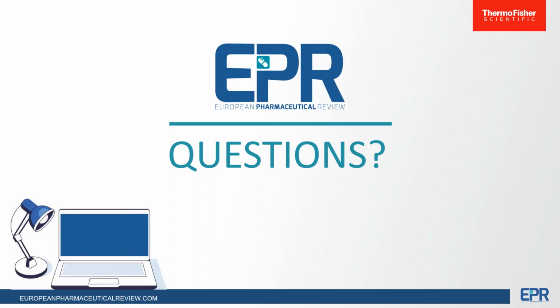So for example, if we are measuring lactose and a customer also has lactose monohydrate and a dihydrate, then you have to make sure that dihydrate does not pass as lactose monohydrate. So a selectivity study done during the validation for an ID requires only specificity to be tested, and if it's specific, then you can replace that.